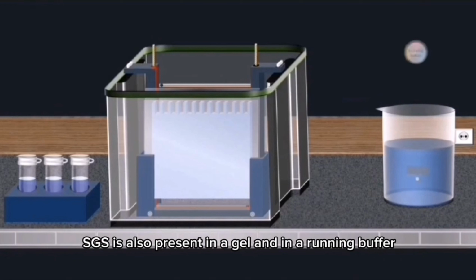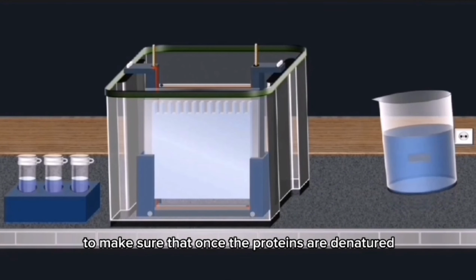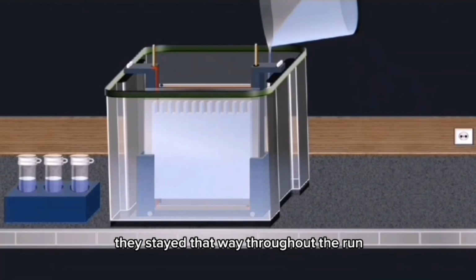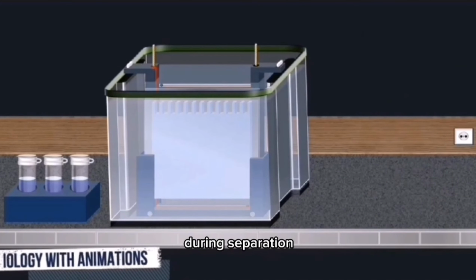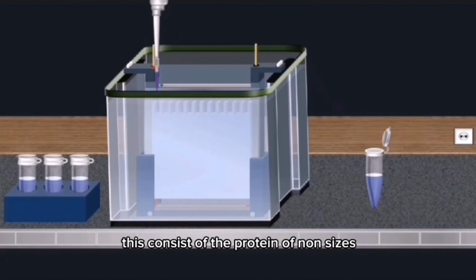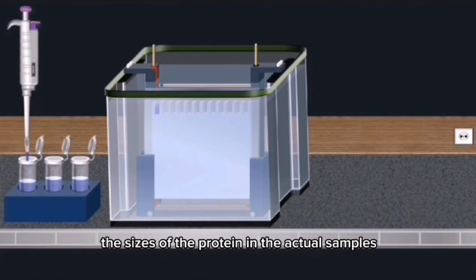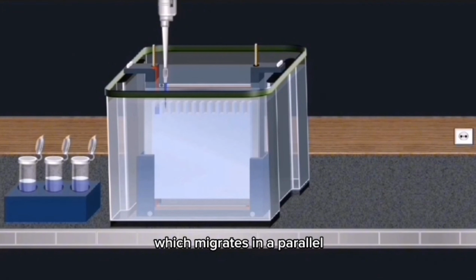SDS is also present in the gel and in the running buffer, to make sure that once the proteins are denatured, they stay that way throughout the run. During separation, a molecular weight size marker is usually loaded onto the gel. This consists of proteins of known sizes and thereby allows the estimation of the sizes of the proteins in the actual samples, which migrate in parallel in different tracks of the gel.